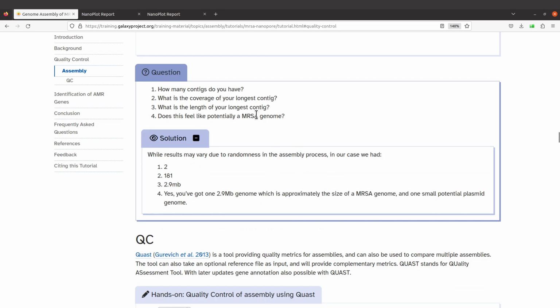So basically, these things will also help you to understand your data and combine it with the biology of the organism. The information you already have also gives you the confidence that indeed the data you have is okay and you are using the right methods and the right tools for the work.